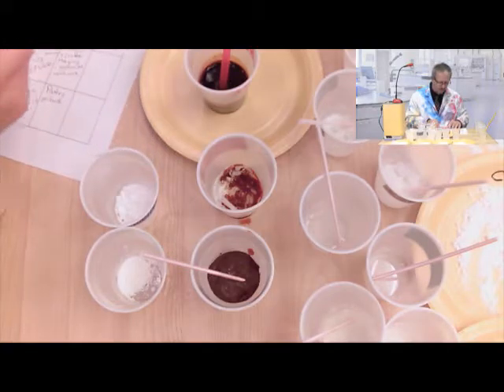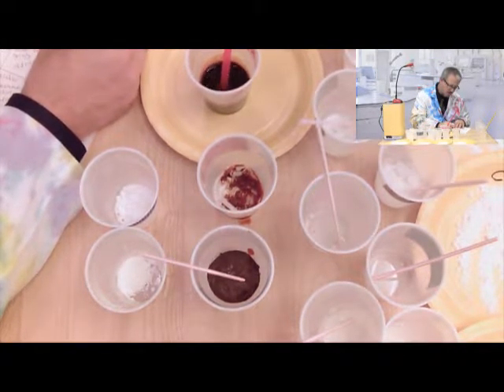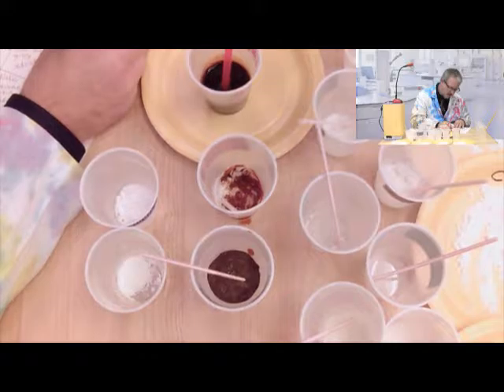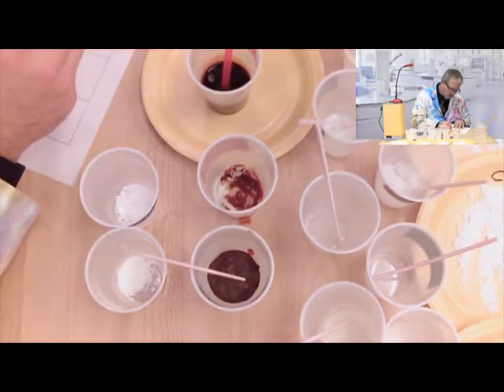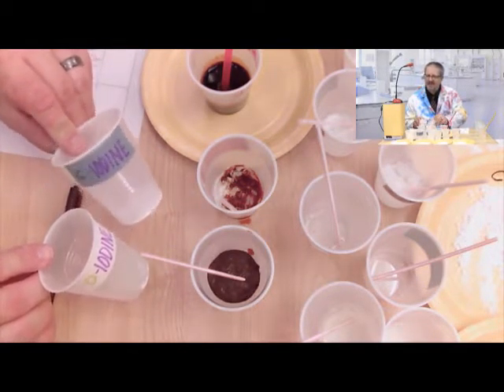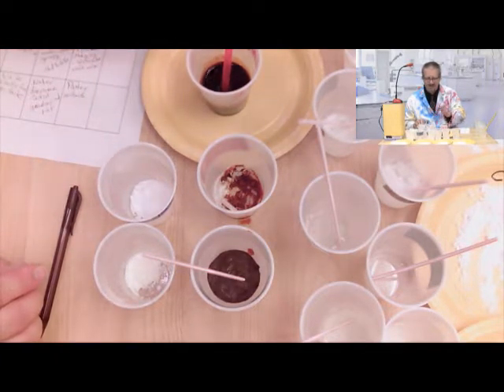All right, so for B, it got foamy, dark red brown, reddish brown. But it didn't fizz or anything, it didn't make any noise. Alright, C, there's C. Alright, so we're going here next.